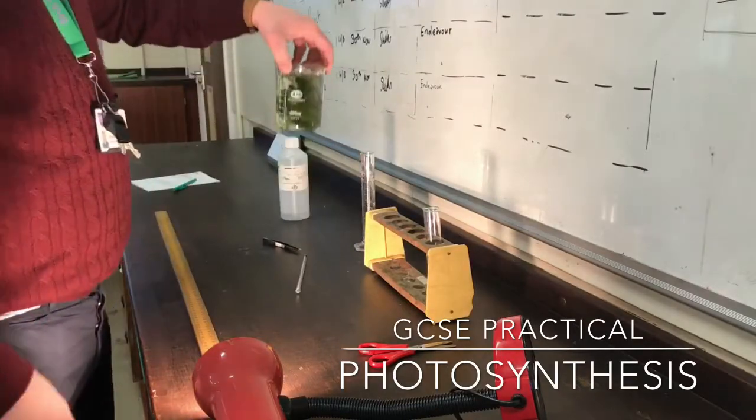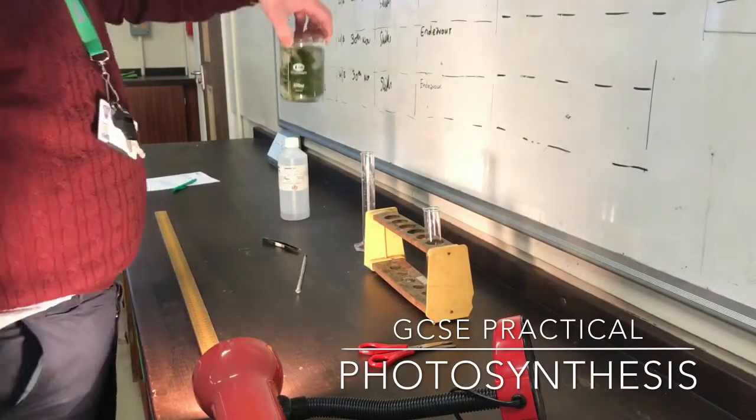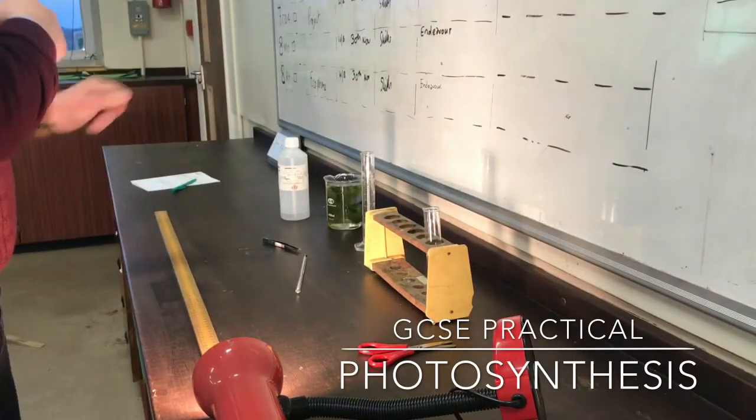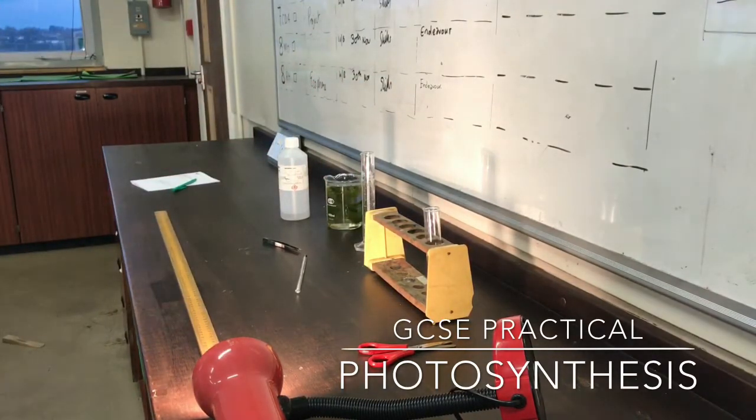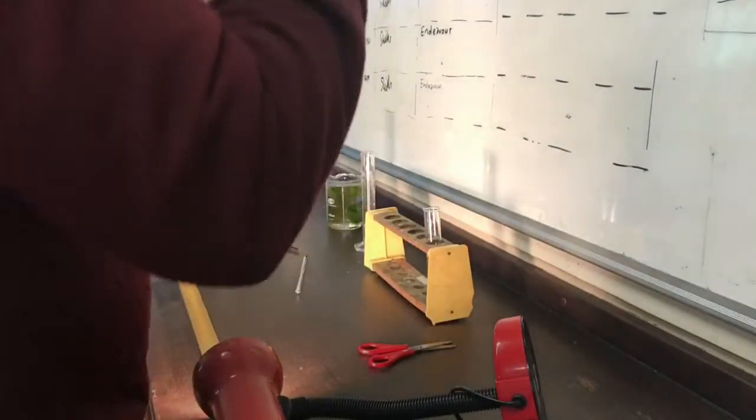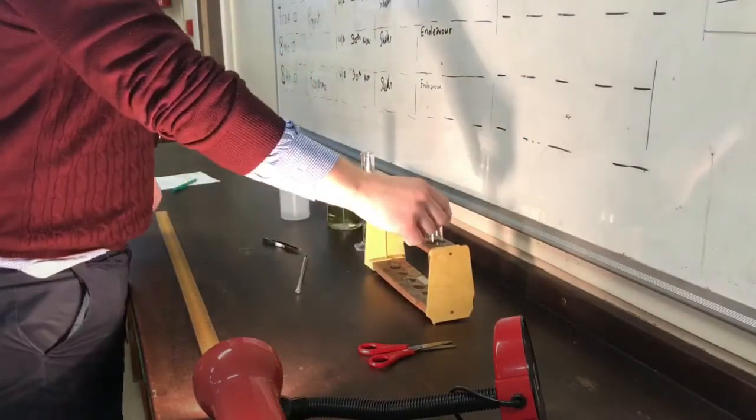And our plant, pondweed, fresh from the pond, preparing ourselves for the experiment. We also mustn't forget to put our goggles on, roll our sleeves up and make sure we wash our hands afterwards.